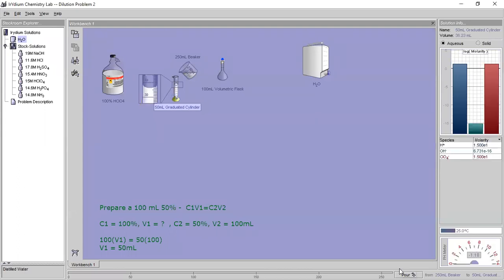And it's kind of quick, so you've got to be quick to do it. Now, if at this part you go over, it's okay. We can take some out. Whew. So I got very close to 50.